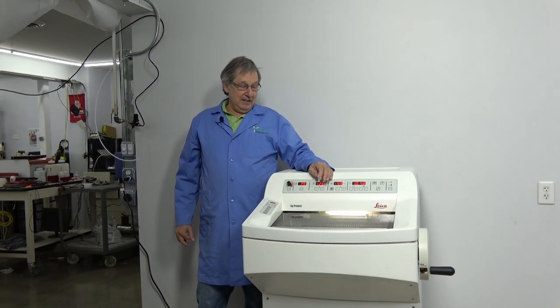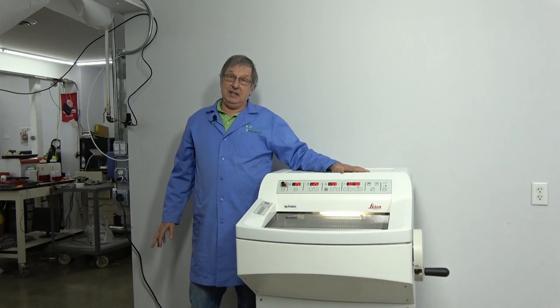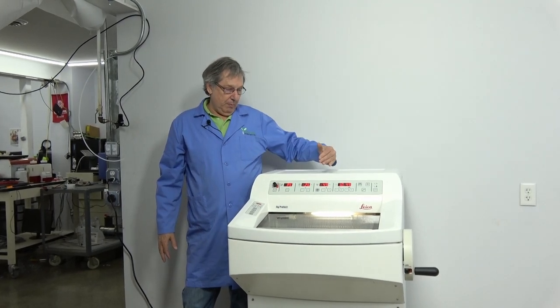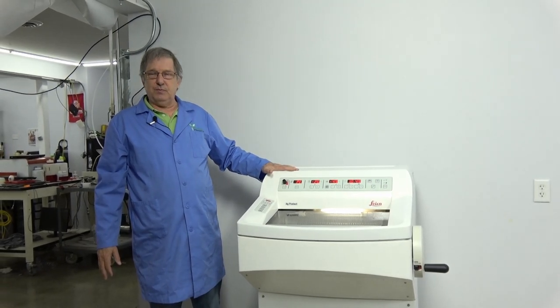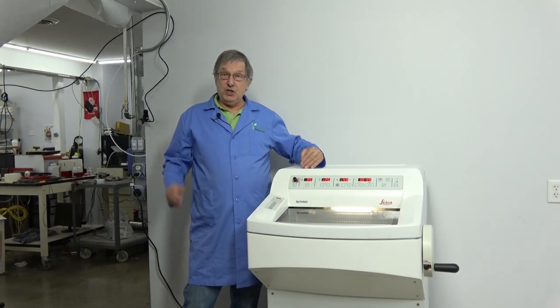Hello, welcome to New Life Scientific. Today we're going to be talking about the CM1950 by Leica. It's a very popular unit, still manufactured. There are lots of different flavors that you can get your cryostat in, depending on which options you elect that you need.